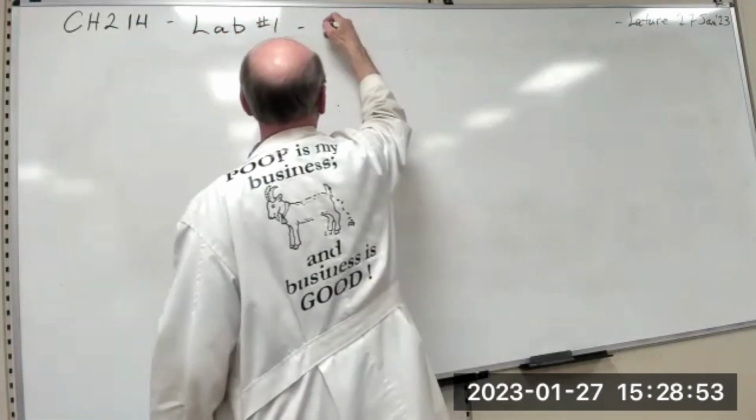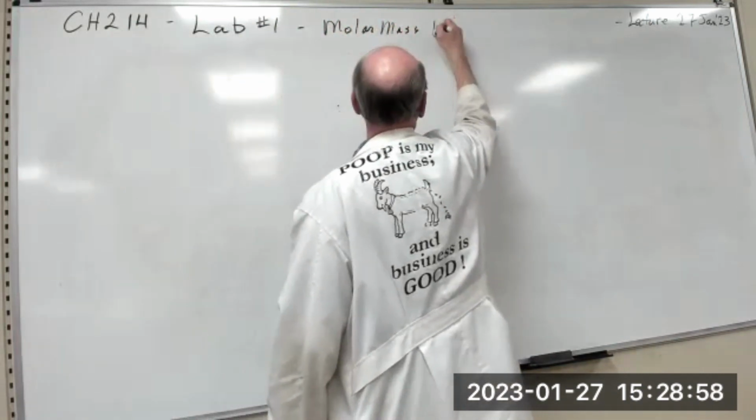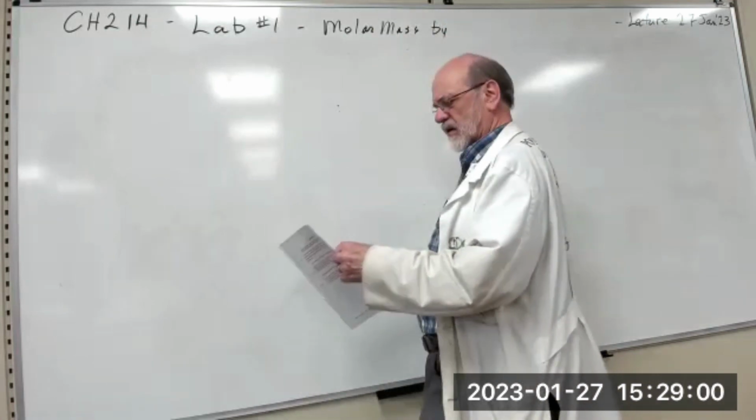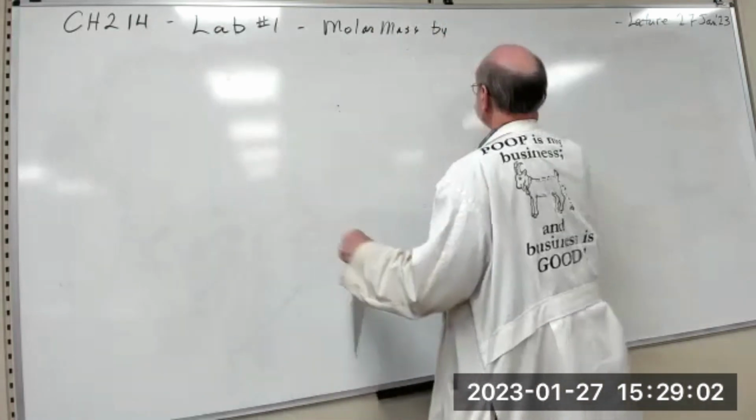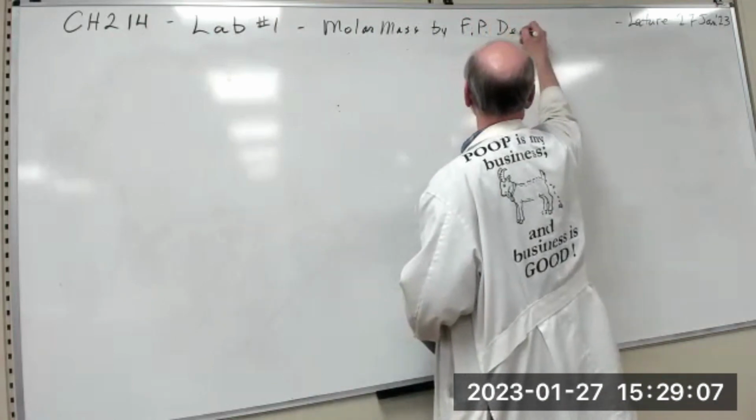Lab number 1. Molar mass by, I think it says molecular weight. No, molar mass. That's right. By freezing point depression.